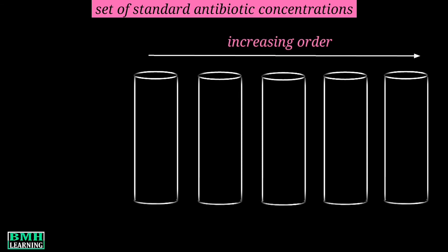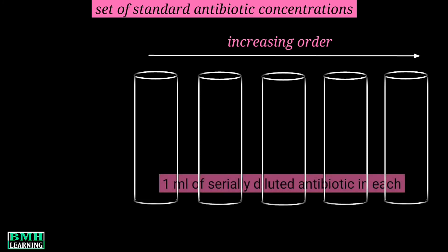We are transferring one ml of serially diluted standard antibiotic in each tube. So the first tube has minimum concentration while the fifth one in the line has maximum concentration.